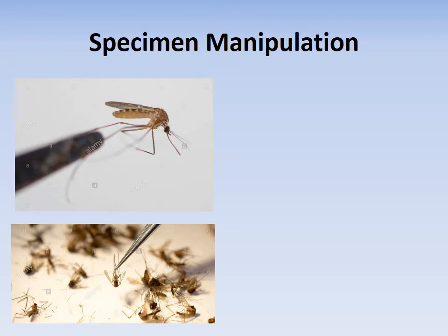When manipulating specimens, you'll be using forceps. Forceps are going to be very foreign to you at first. Manipulating these mosquitoes is not going to feel natural. But after a while, it's going to be like an extension of your hand. It's going to be very, very fluid.